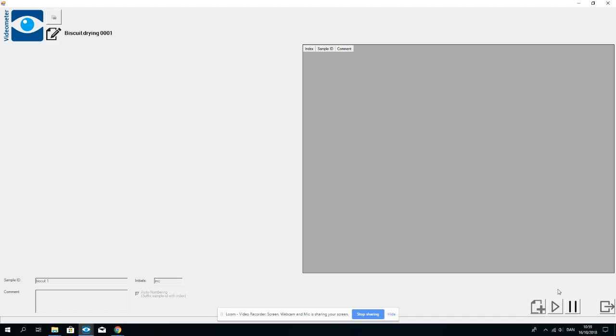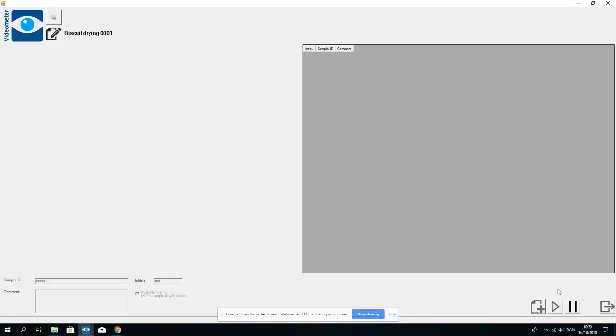So now the instrument will go down and take a multi-spectral image. It will present it as a color image on the left side of the window.